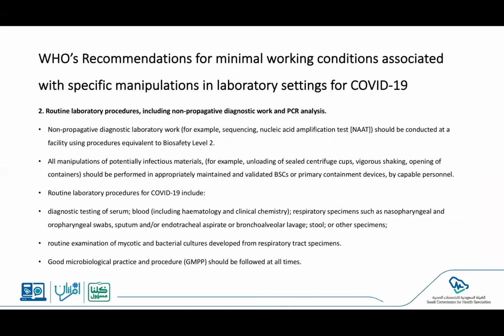In the following, I will be talking mainly about the other recommendations that are needed when we are manipulating samples associated with diagnostic purposes for COVID-19 samples. So basically in routine clinical microbiology, the laboratory work, for example PCR or RNA extraction, needs to be done at a biosafety level 2 laboratory, because biosafety level 2 laboratories will ensure there are certain biosafety cabinets that need to exist, and we will go through this in detail in a little bit.